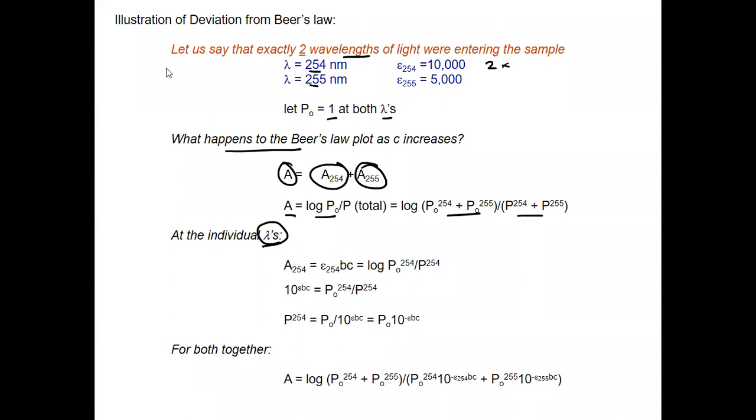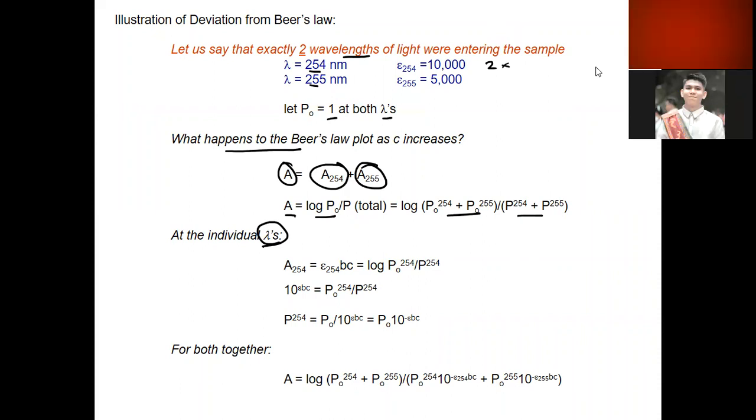What happened here is the absorbance is just equal to the log of the light that entered your sample over the light that goes out.